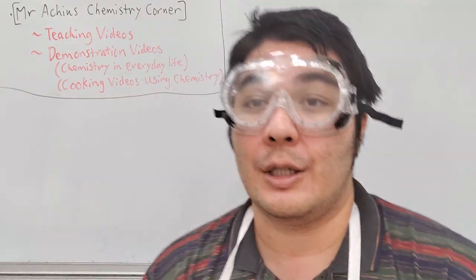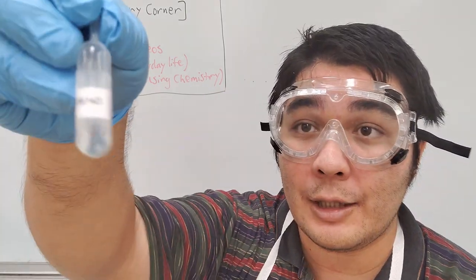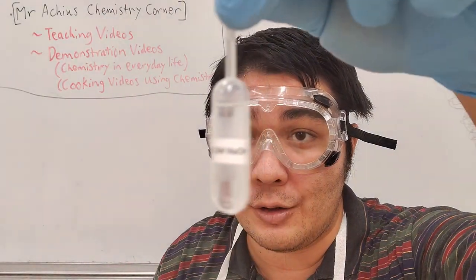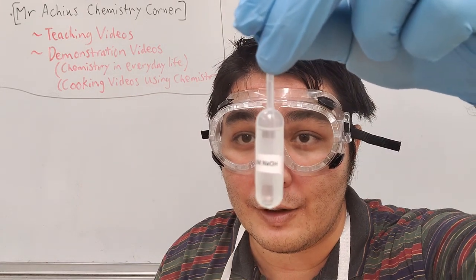In this one, I'm going to take some hydrochloric acid and I'm going to mix it with some sodium hydroxide over here. Hopefully you can see that.